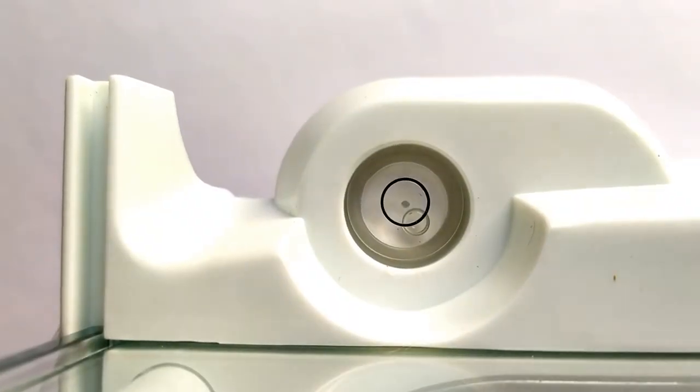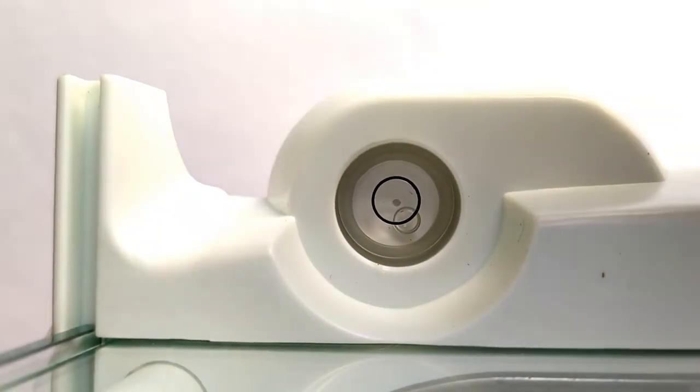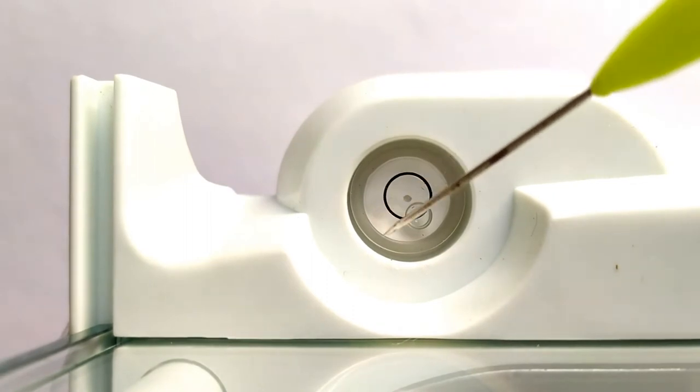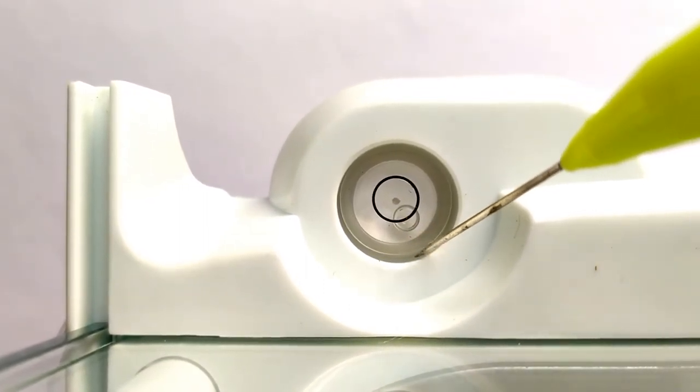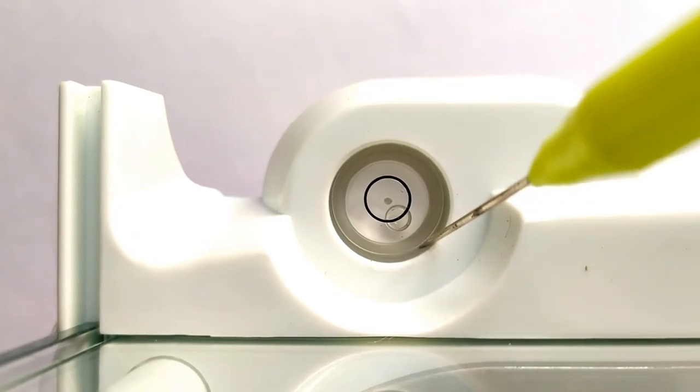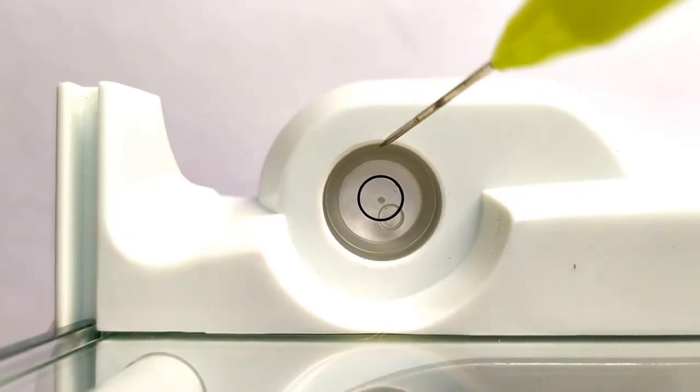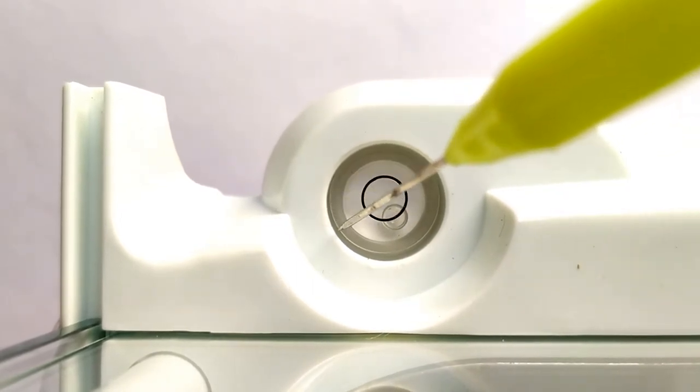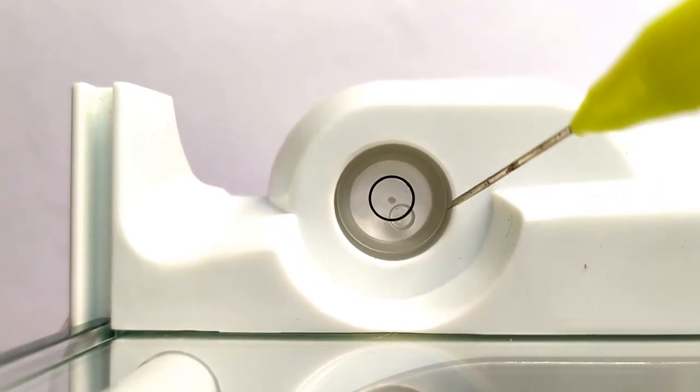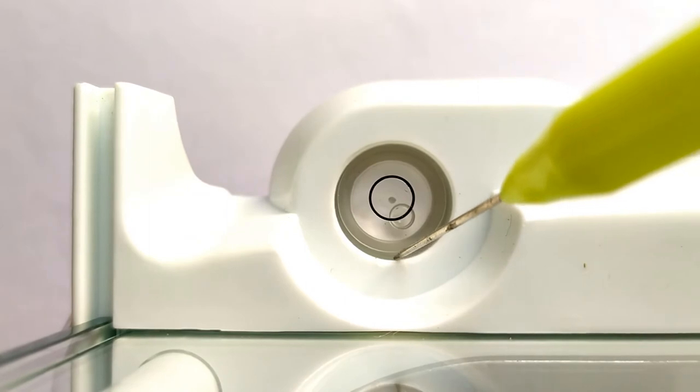The leveling gauge slopes on one side as you can see here. As a result, a huge gap is left behind on one corner so much so that even the tip of this needle fits snugly into the gap while there's no gap on the other corner. The consequence of this manufacturing flaw is that the leveling gauge is practically useless for leveling the entire machine.